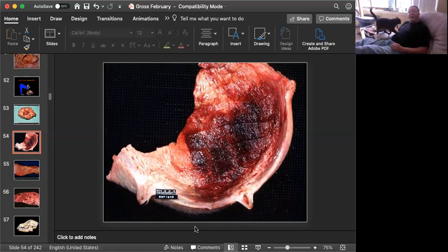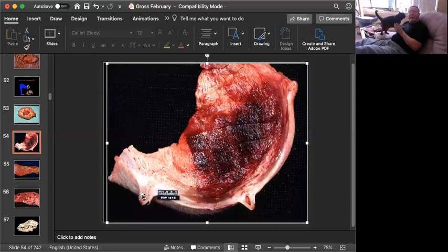Okay, well, we're looking at the mammary gland, and it has been cut here so we can see 2 of the mammae or the teats, and there's a focally extensive, very well demarcated area of necrosis and hemorrhage affecting one of these quarters. This is a great picture for conditions that usually happen to cows during the summertime. They're in milk, they're being milked, and they're also living in a place with liquid poop. If you've ever been to a milking parlor or where they bed down dairy cows, there's always liquid poop. In the wintertime, we don't see these diseases as much because, at least outside, the poop is frozen.